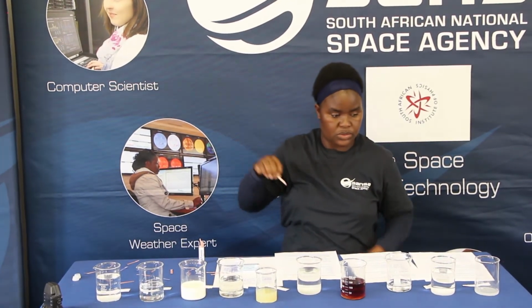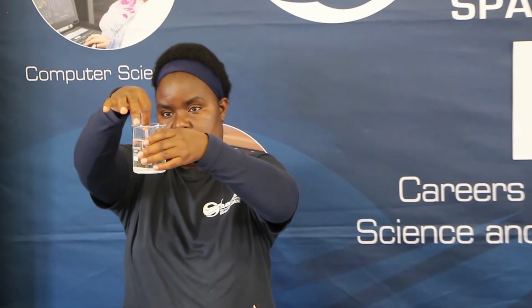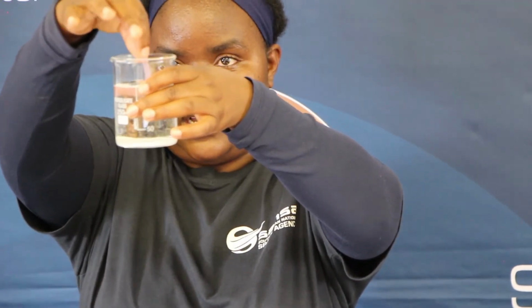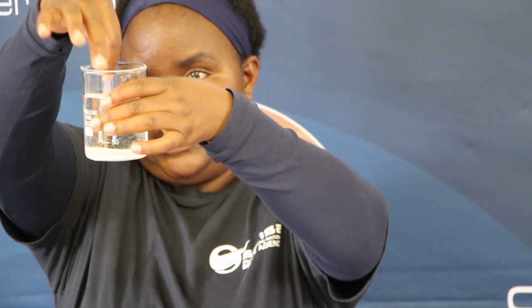So the next one is gonna be the baking soda solution. If I can find it. Oh, here. At the very edge of the table. Look what is happening here. What happened when I put this paper into the solution? Are there any changes? Can you see?